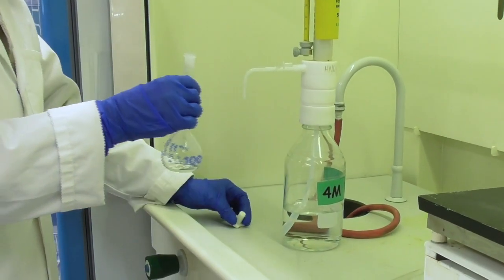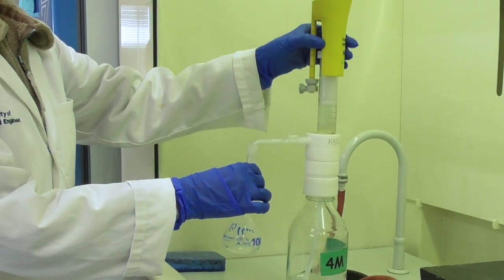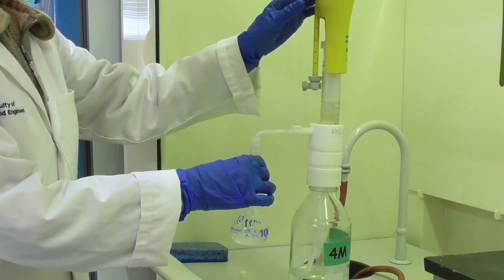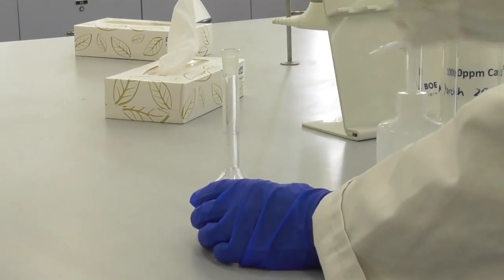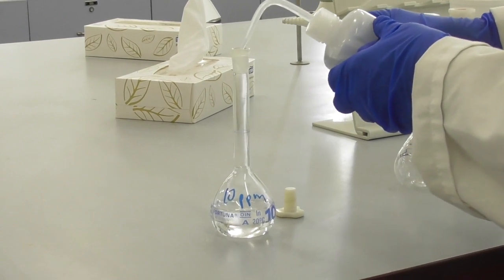Next I head to the fume hood and add 50 milliliters of nitric acid into my volumetric flask. This is to ensure that the standard solutions are close in composition to the actual sample solutions which also contain nitric acid.